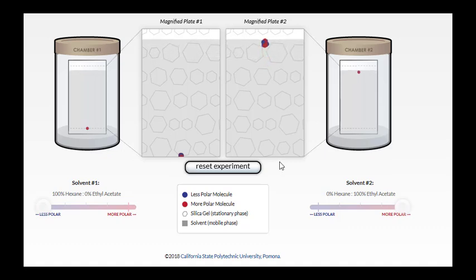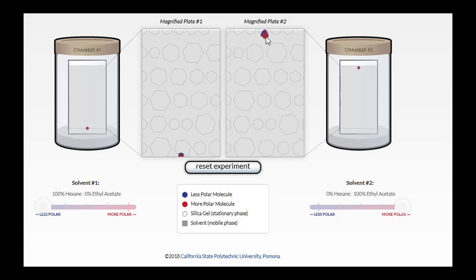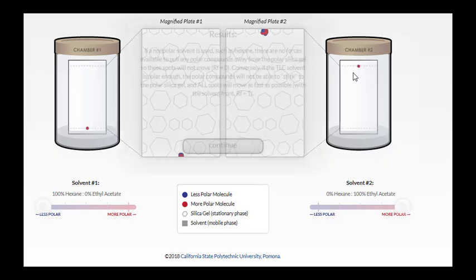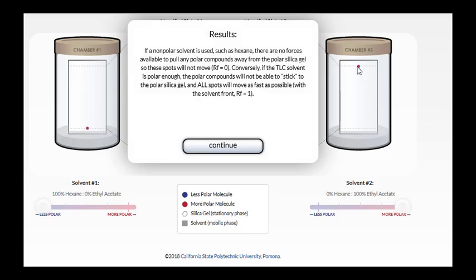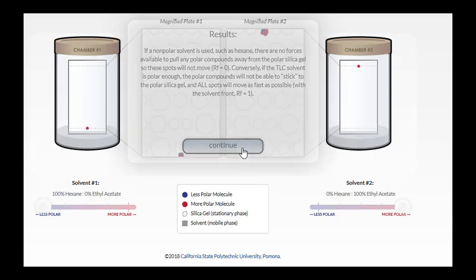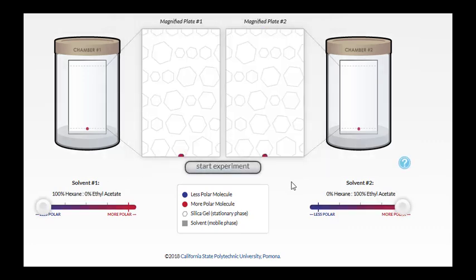When we use a solvent that's too polar, all of our spots move totally with the solvent front, and they end up at the very end, all the way as far as our solvent traveled. That's described as having an RF of 1. So neither of these results are very good if we want to try and analyze our mixture. Ideally, we want a solvent where we do get a separation, and our samples are somewhere in between.